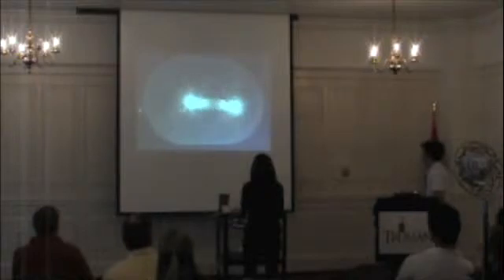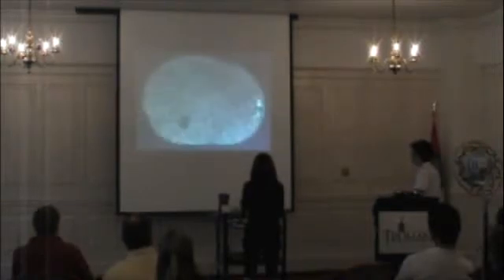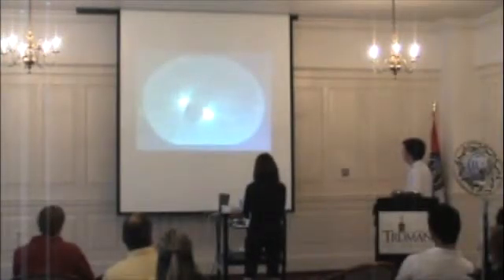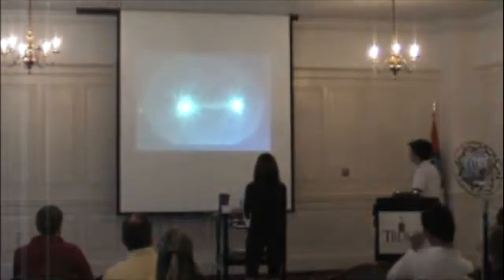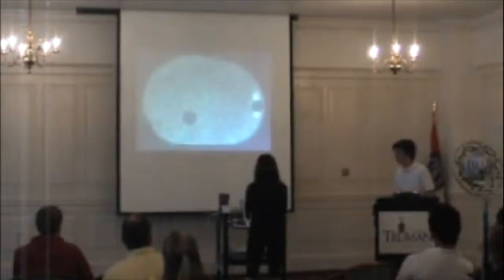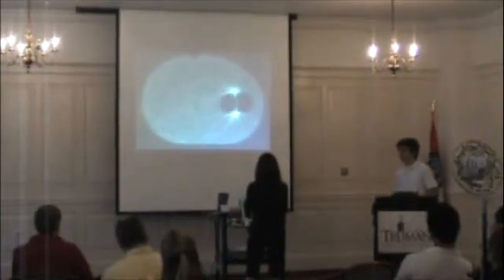And here we didn't make this. This was taken from the site that's on the website, on the slide. But there's beta tubulin labeled with GFP that labels the microtubules, and it allows us to really visualize these centrosomes, or I suppose more correctly, the microtubule organizing centers. And clearly, as you see the division occurring, they play a very important role in mitosis. They don't simply migrate away from each other. Their movements are directed and very important to the invariant lineage that we're talking about.